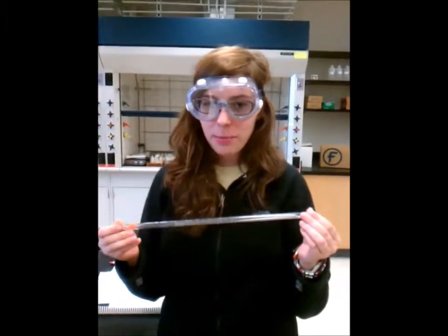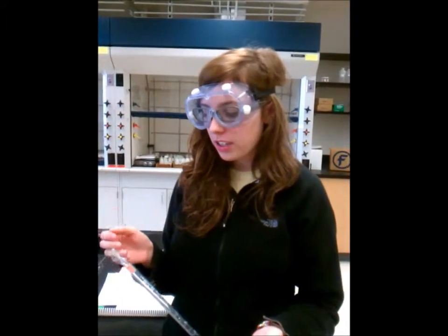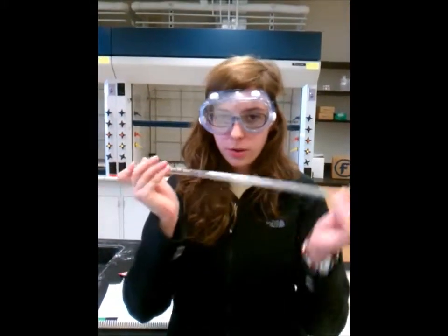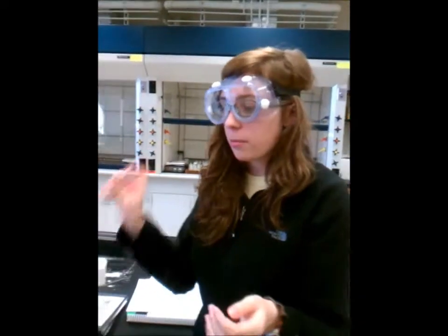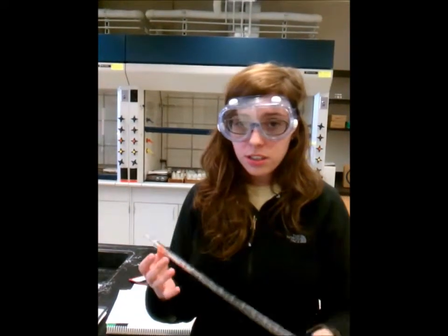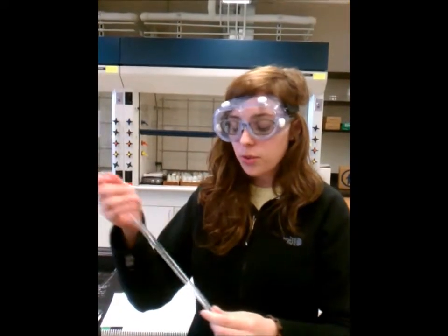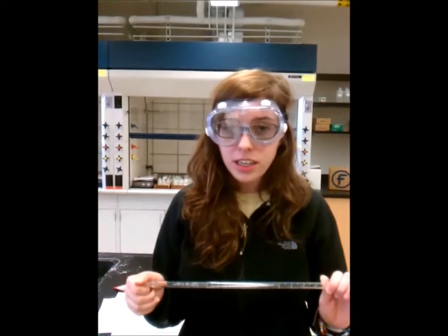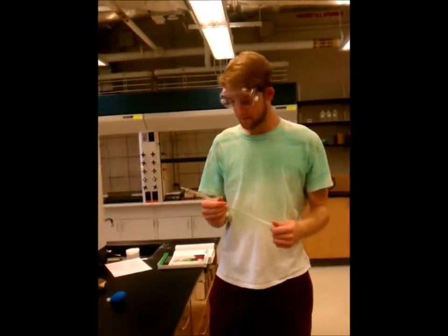To clean the pipette, what we do is first we get the pipette, we fill it up with water, we grab it, we rinse it around, we dump it out in the sink. We do that 3 times. Then we get our solution, we grab it, we fill it up to a reasonable amount, switch it, dump it in the sink or a waste beaker, and we do that 3 times as well. So then our pipette is clean and ready to use. So this is how you use a pipette.